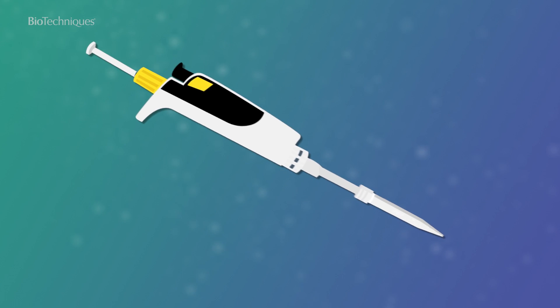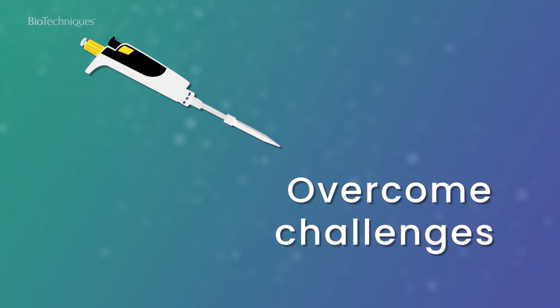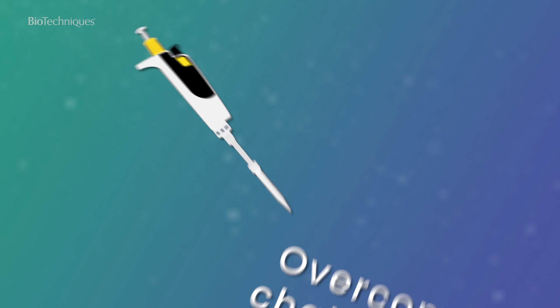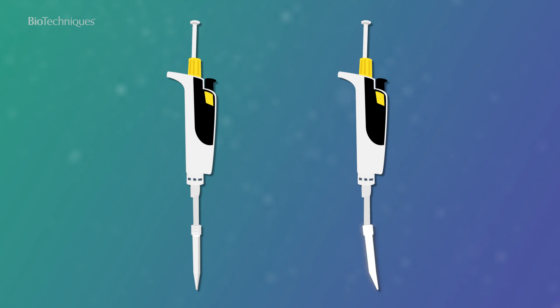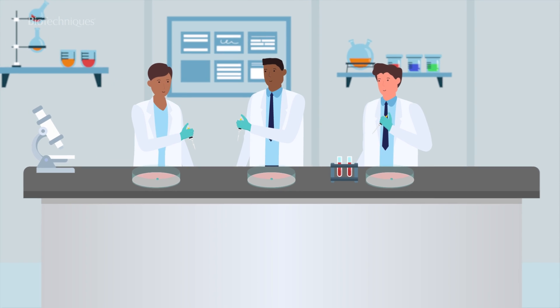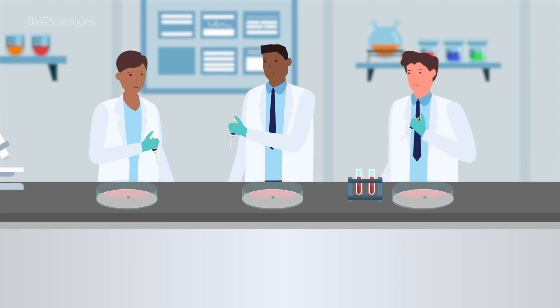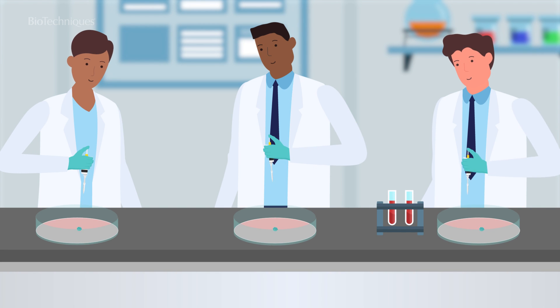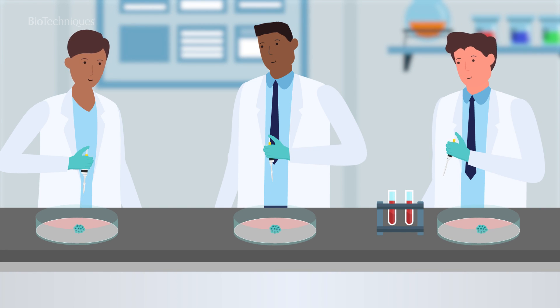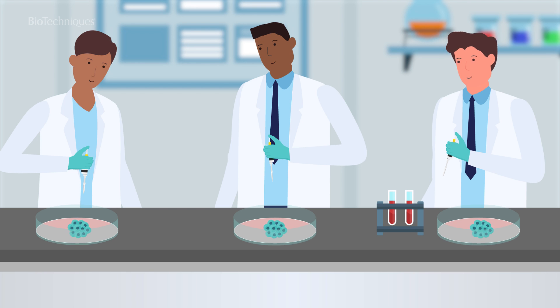There are a number of steps you can take to overcome the challenges faced when pipetting 3D cell cultures. Ensuring that the pipette tip fits optimally to the pipette will help you achieve the best results. Another step is the use of electronic pipettes. With electronic pipettes, you can use fixed pipetting speeds and mixing steps, consequently minimising the variability introduced by individual pipetting practices.